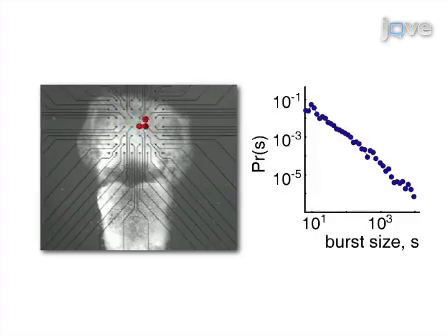Results are obtained that show the spontaneous self-organization of spatiotemporal local field potential bursts into neuronal avalanches based on MEA recordings and offline avalanche analysis that identifies the power law in avalanche sizes. The main advantage of this technique over existing methods such as dissociated cultures is its systems neuroscience aspect. We can co-culture many brain regions together, and these multi-region cultures establish a brain organization that is correct at the large scale, such as cortical layers and projection systems.